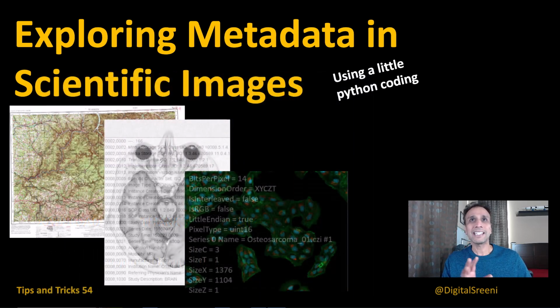Okay, so as the title suggests, we are going to talk about metadata, which is very important to understand for various reasons, and I'll talk about that as we get into our Python code. In fact, I added a whole bunch of notes into this Python file that I'm going to share with you. Look for the link down below under the description, and that can serve as your additional notes in case you need to refer to it in future. Okay, so with that, let's just jump into our Python IDE and go through it.